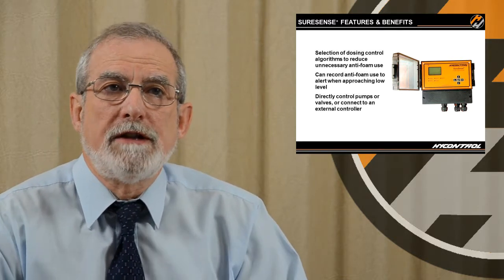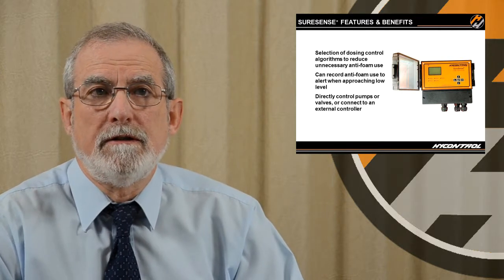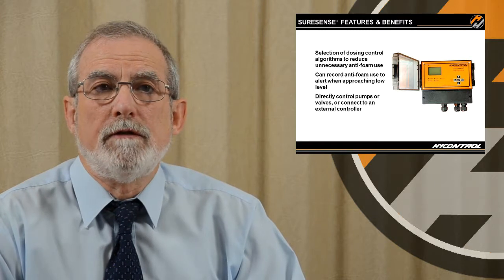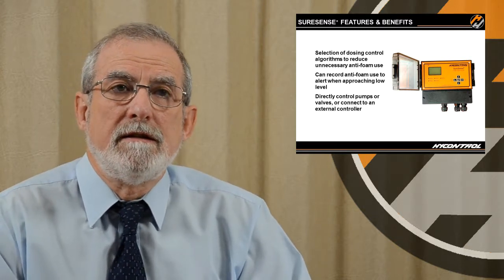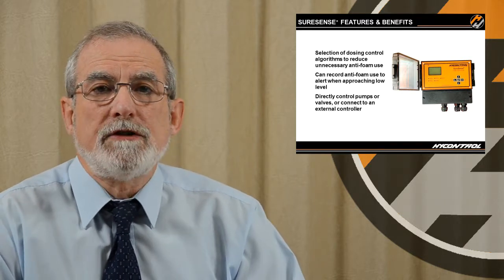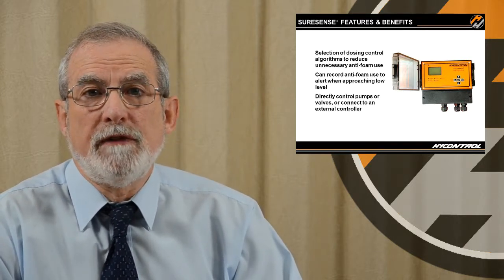There are a variety of dosing algorithms that we've developed, so we can have a simple on-off device and something more advanced. I'll talk about that in a minute. We can actually use it to record how much antifoam we've added.